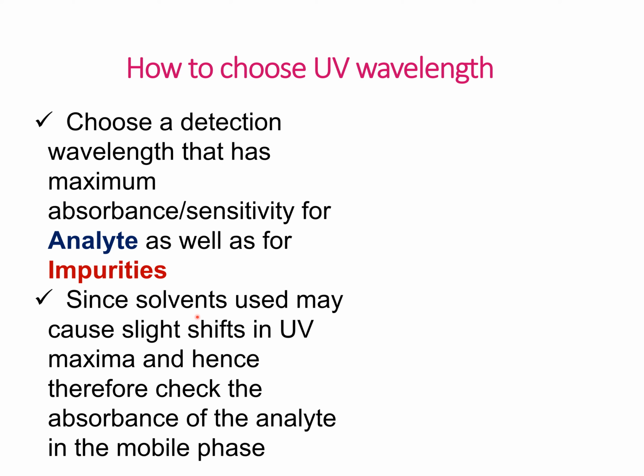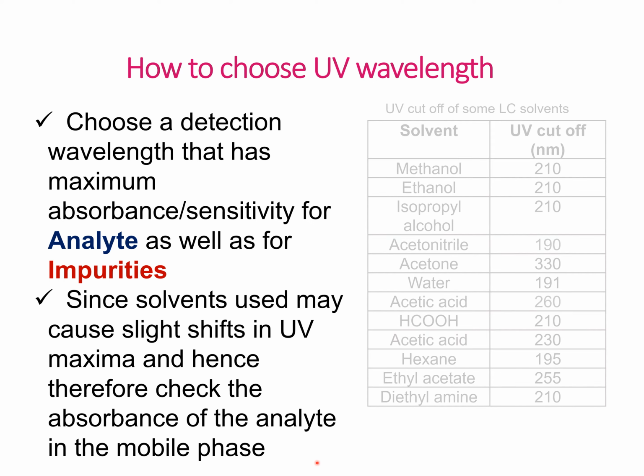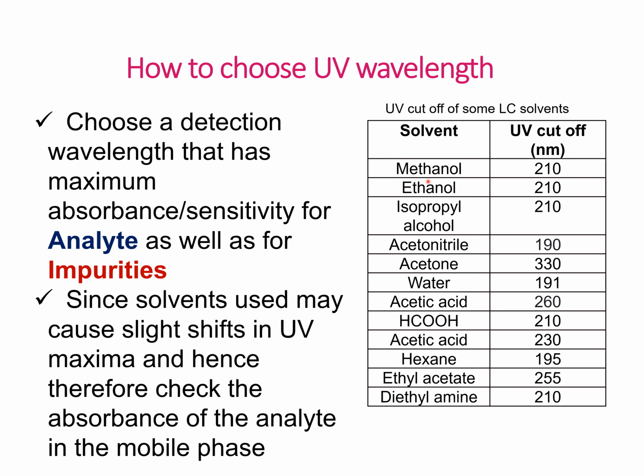Since solvents used may cause slight shift in UV maxima, check the absorbance of analyte in the mobile phase. Since each solvent has its own UV cutoff, keep in mind while selecting the wavelength during method development, keep the wavelength more than UV cutoff.